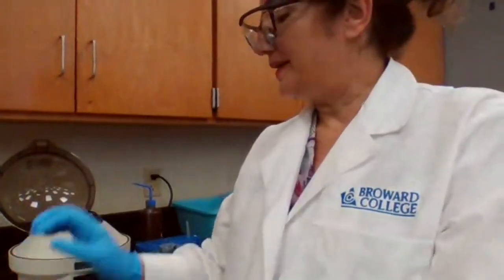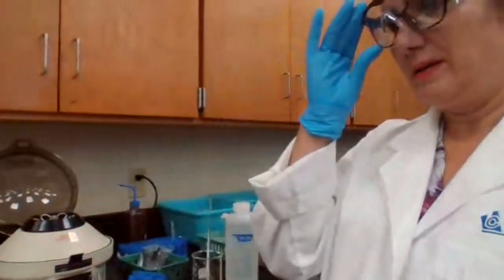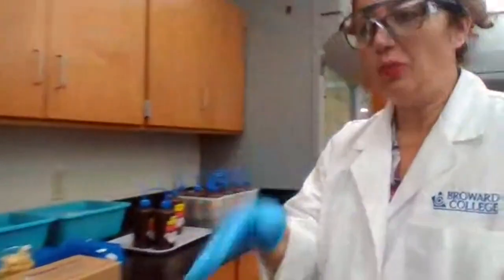What happens when you add ammonia? The manual does explain with the chemical reactions why this is going to dissolve. The complex that is forming here, the ammonia complex of the ion, is aqueous. So we are adding 6 molar NH3. What is NH3? NH3 is ammonia, and we all know that ammonia is a gas. So when we say 6 molar ammonia, that means it's ammonia in water.